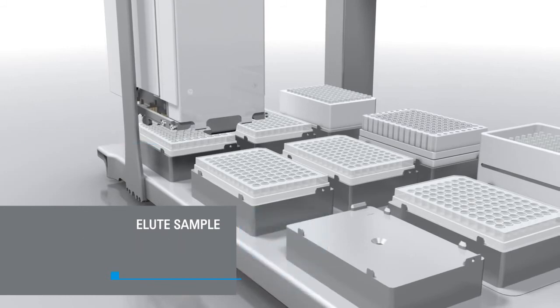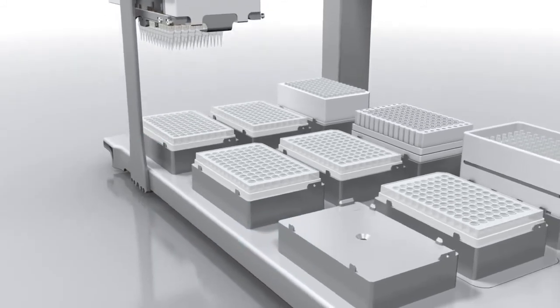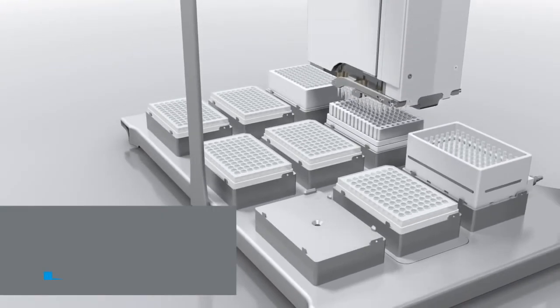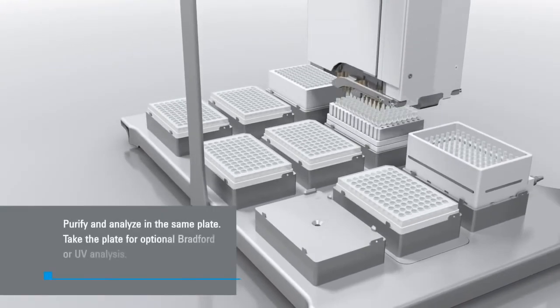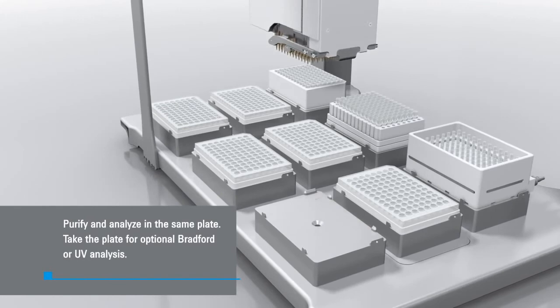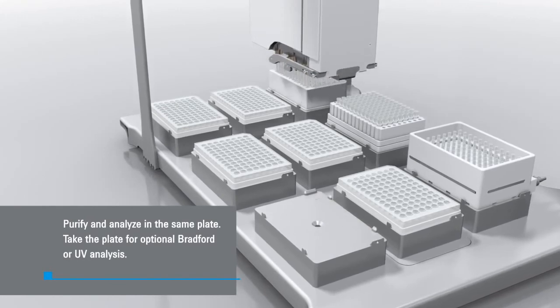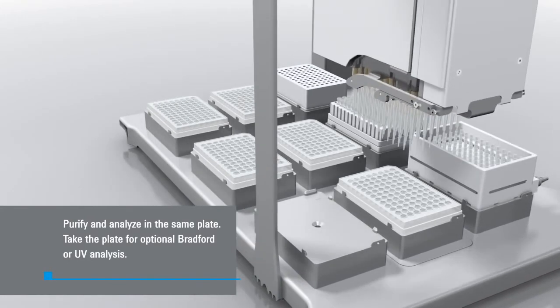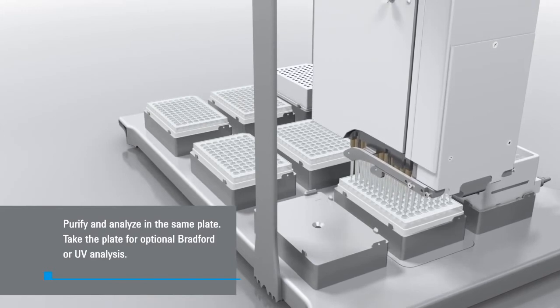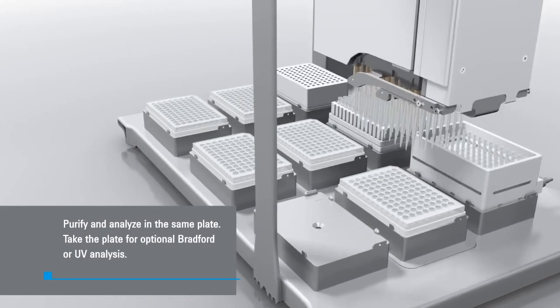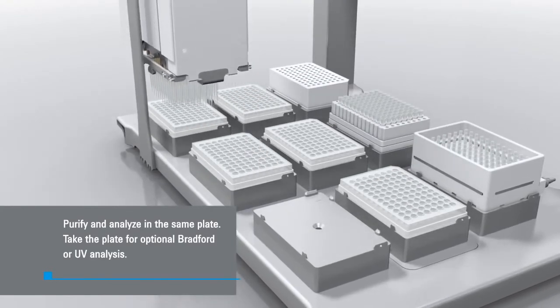The purified antibody is now ready for quantitation or for further characterization. In this example, the sample is quantitated by the Bradford protein assay. Pipette tips are pressed on the syringe probes, Bradford reagent is aspirated into the tips and then dispensed onto the purified antibody sample for further offline quantitation.